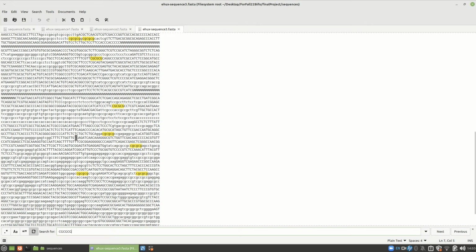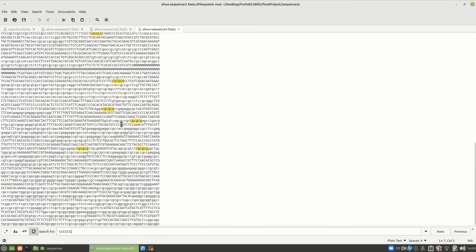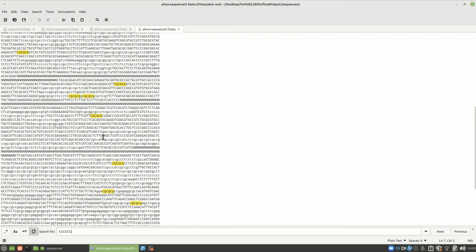Maybe we're moving into the first exon. Maybe it could be a long exon. Or maybe we've moved on to another gene down here. So somewhere in here, I would say this is definitely a promoter. So it might be a small gene somewhere in here. And this looks like good sequence. This isn't as clear a signal as good sequence.